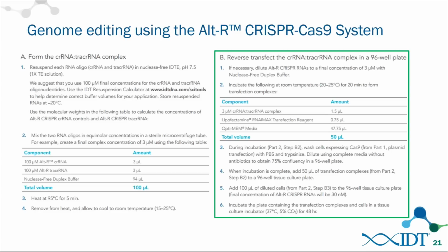And as I mentioned earlier, and the same is true for the TransIT-X2, there may be some tweaks, modifications to the protocol that would be more optimal, that could be made to optimize your specific experiments in your specific cell line. In our hands, in HEK293 cells, HeLa cells, HEPA-16 cells, rat RG2 cells, these are the conditions that we have shown to be optimized.